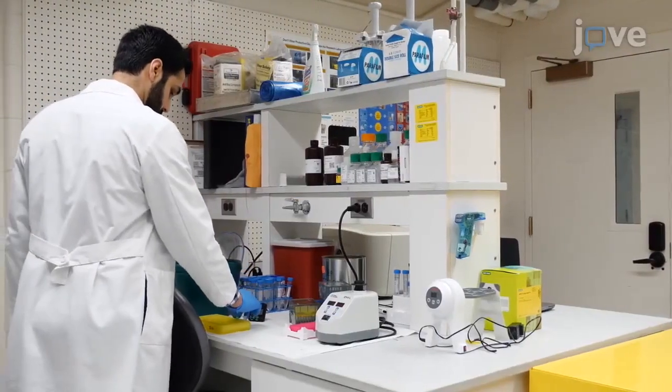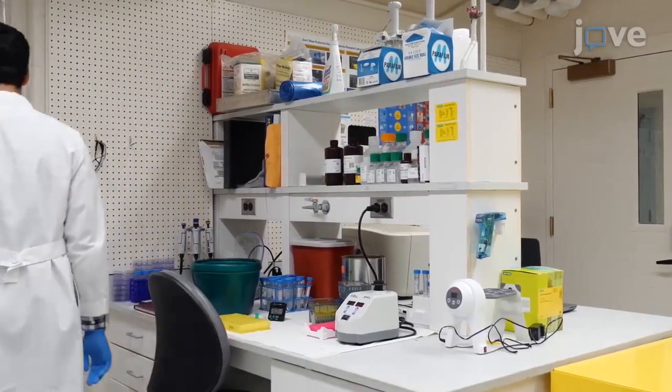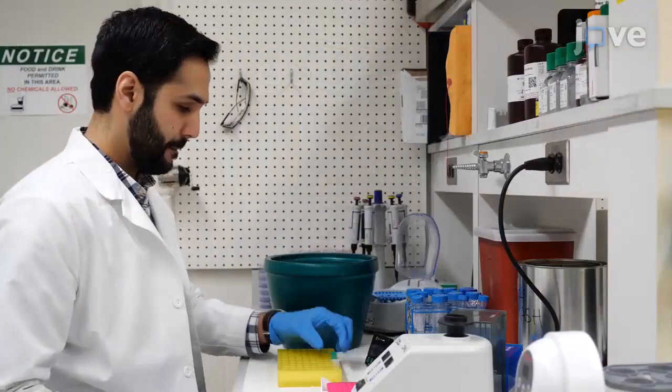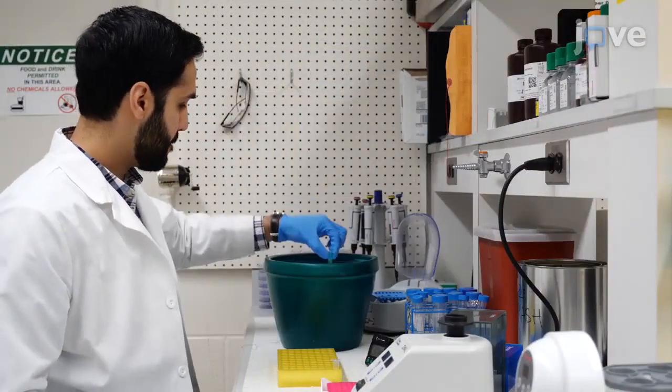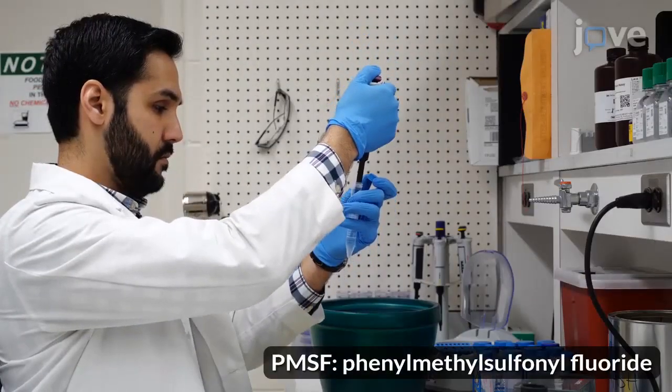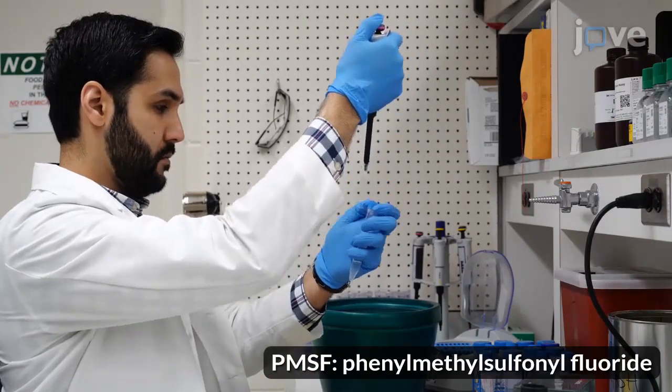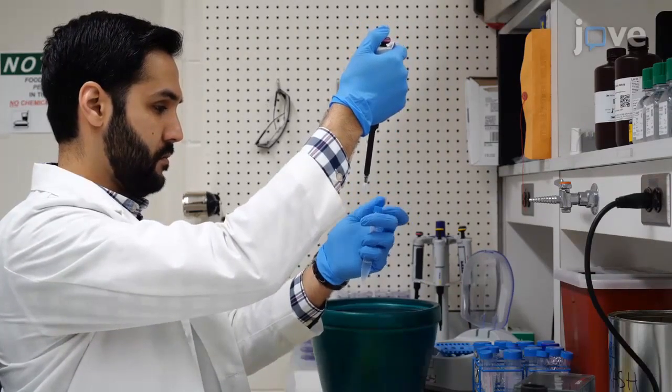Immediately prior to cell lysing, thaw a frozen aliquot of NP40 lysis buffer. Once thawed, place the lysis buffer on ice. Add PMSF protease inhibitor to the NP40 lysis buffer to reach a final concentration of 0.2 millimolar.